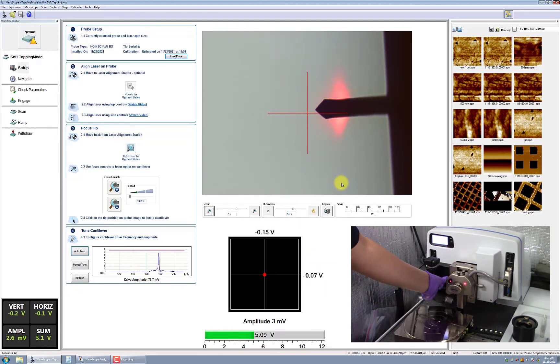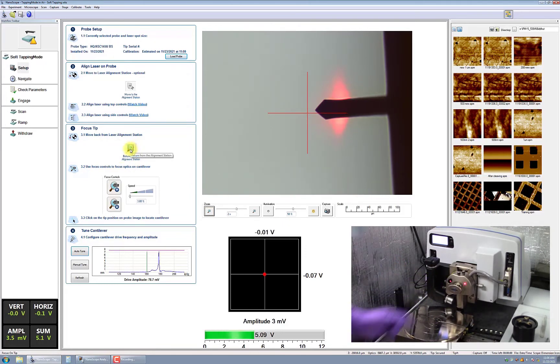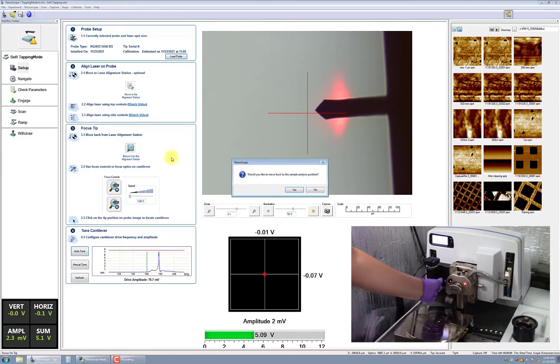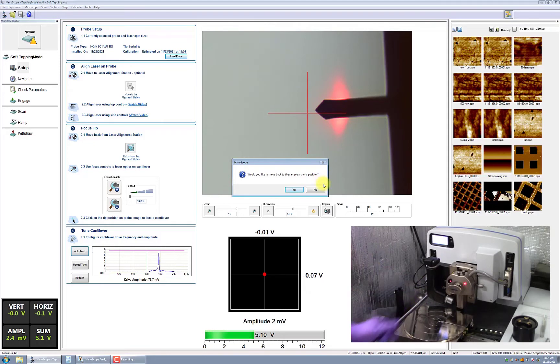Once the alignment is complete, press Return from alignment station. A dialog box will pop up and ask, Would you like to move back to the sample analysis position? Select No.